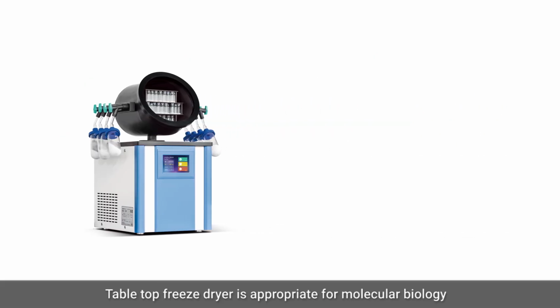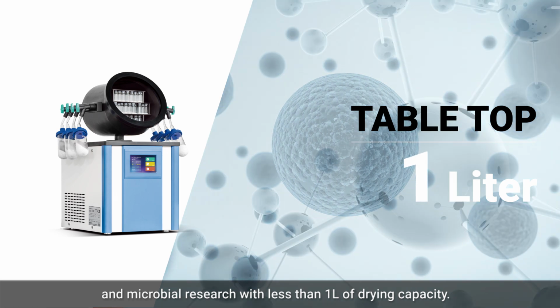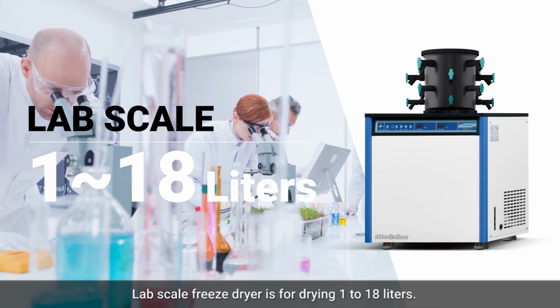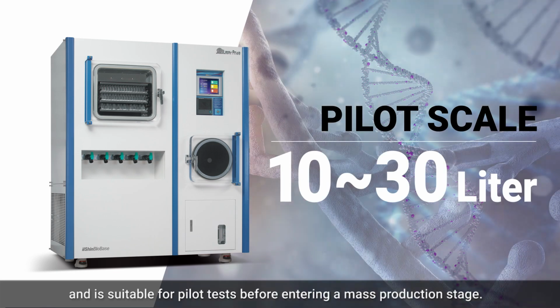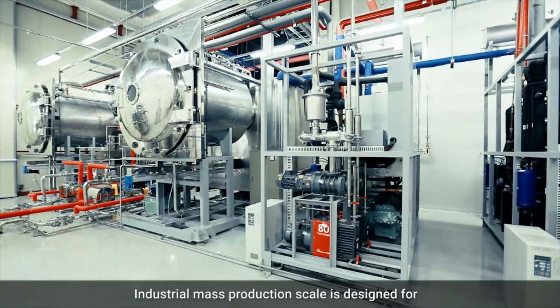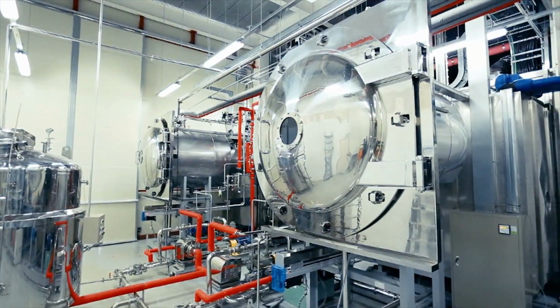Tabletop freeze dryer is appropriate for molecular biology and microbial research with less than 1 liter of drying capacity. Lab scale freeze dryer is for drying 1 to 18 liters. Pilot scale dries between 10 and 30 liters and it is suitable for pilot tests before entering a mass production stage. Industrial mass production scale is designed for 50 to 500 liters of drying capacity.